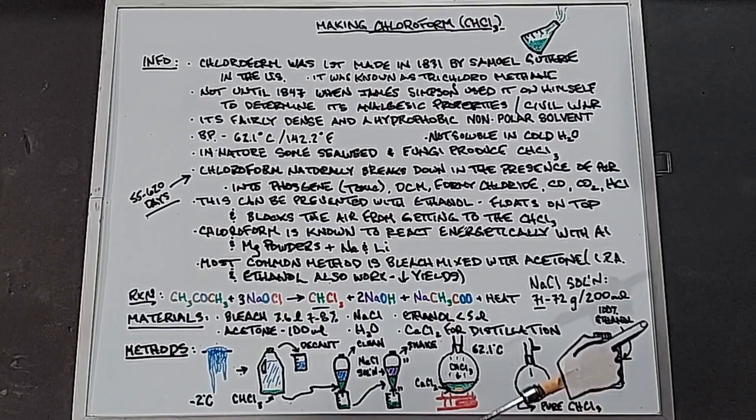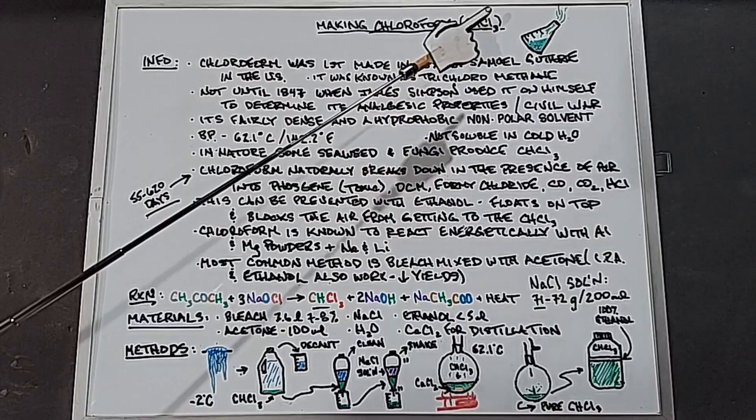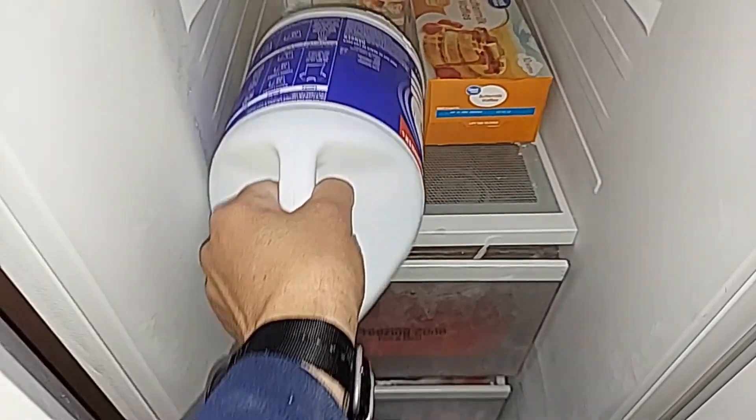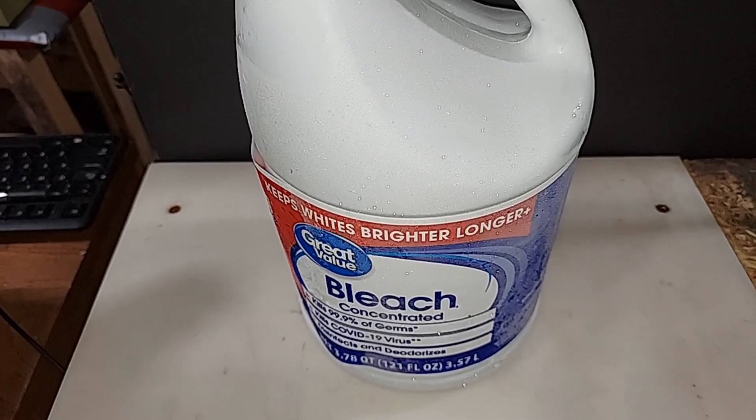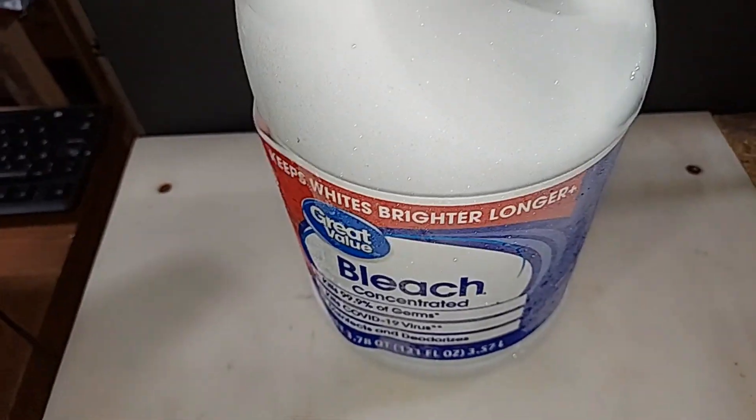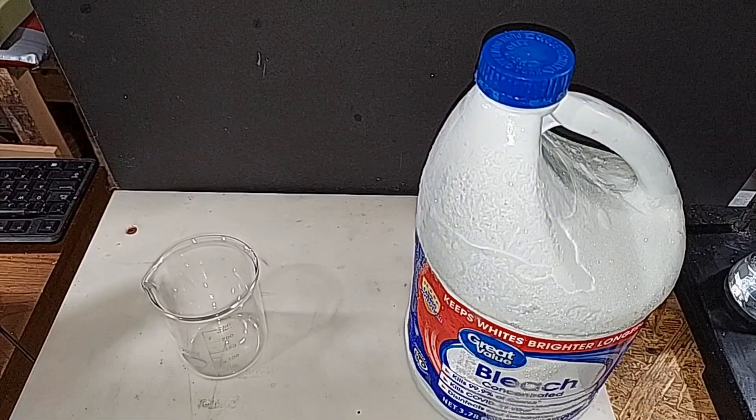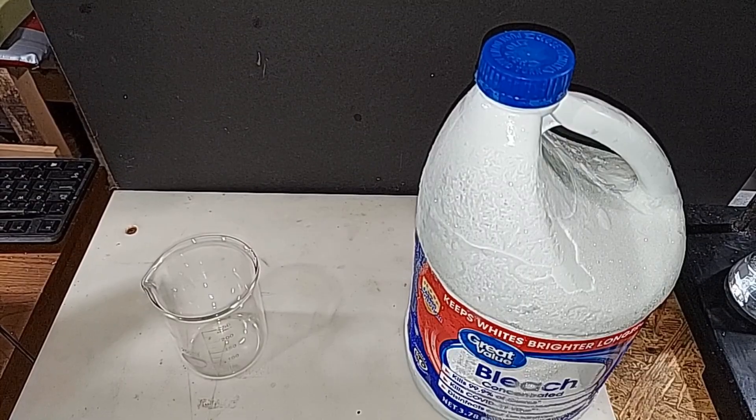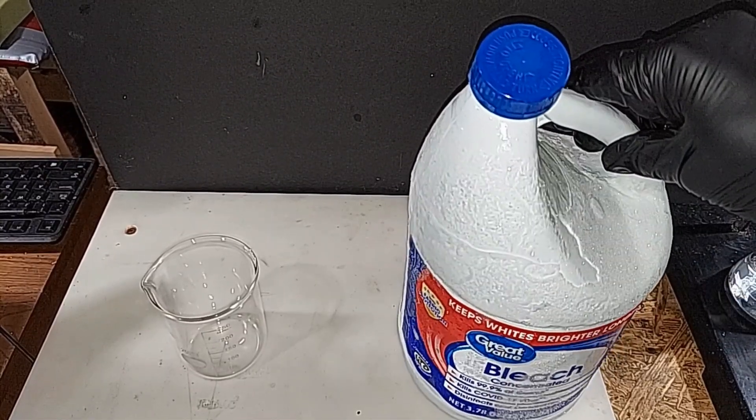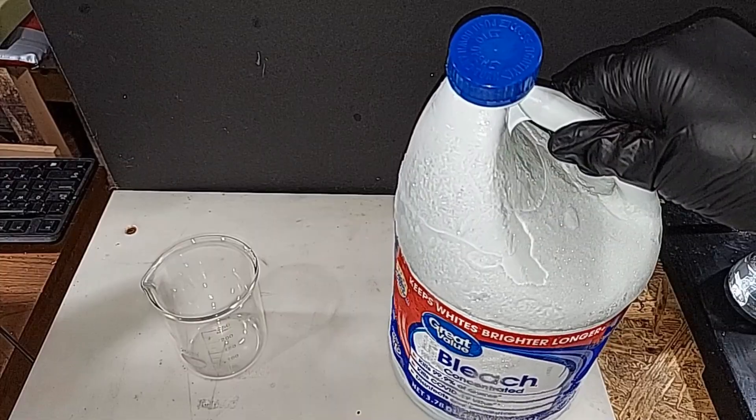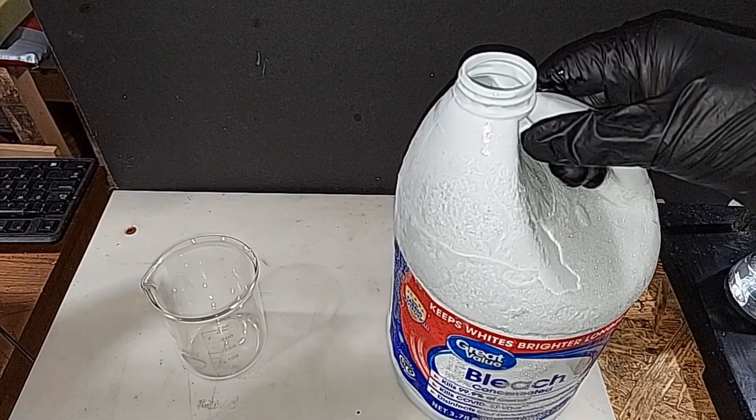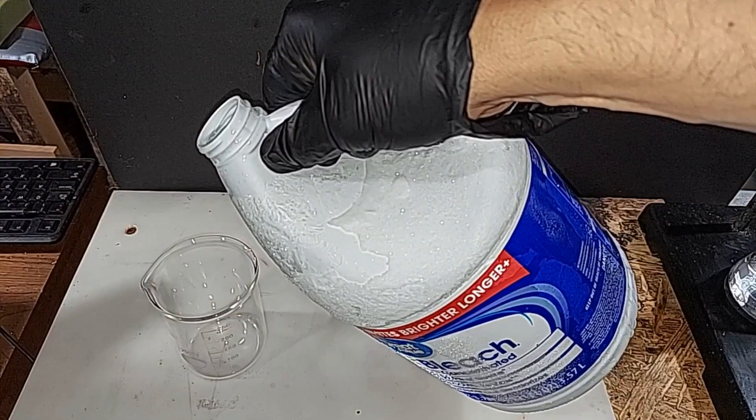We start making our chloroform by getting our bleach very cold. It's been in my freezer a couple days, which is set pretty cold. I didn't realize this when I pulled this out, but it's a solid block, so that's got to thaw. I took bleach from a different container and heated it up and poured it inside. Because this is exothermic, I'm going to go ahead and do this. We need to pour out 100 milliliters of bleach because we're going to put the acetone in there, of course.